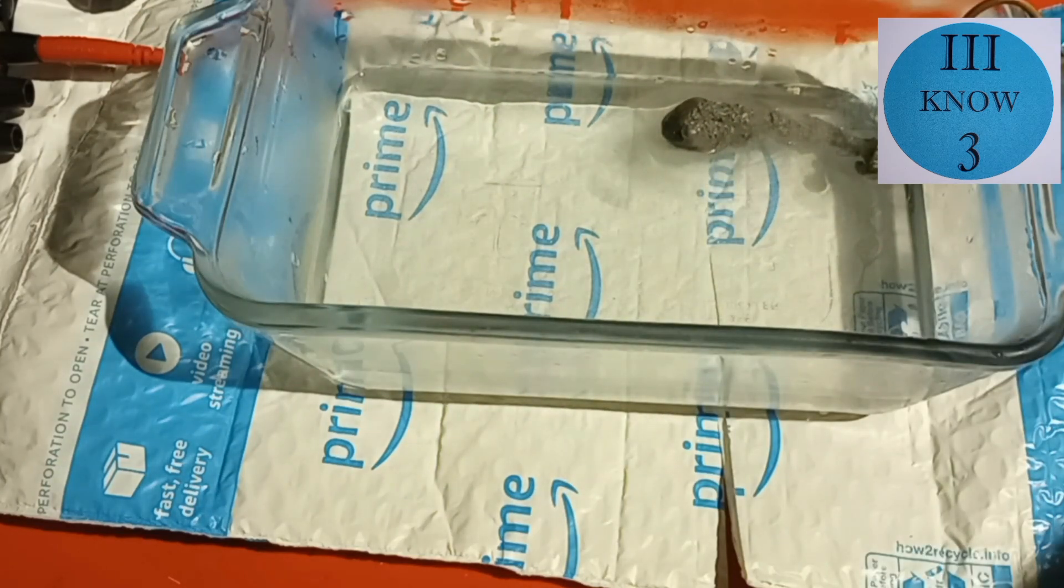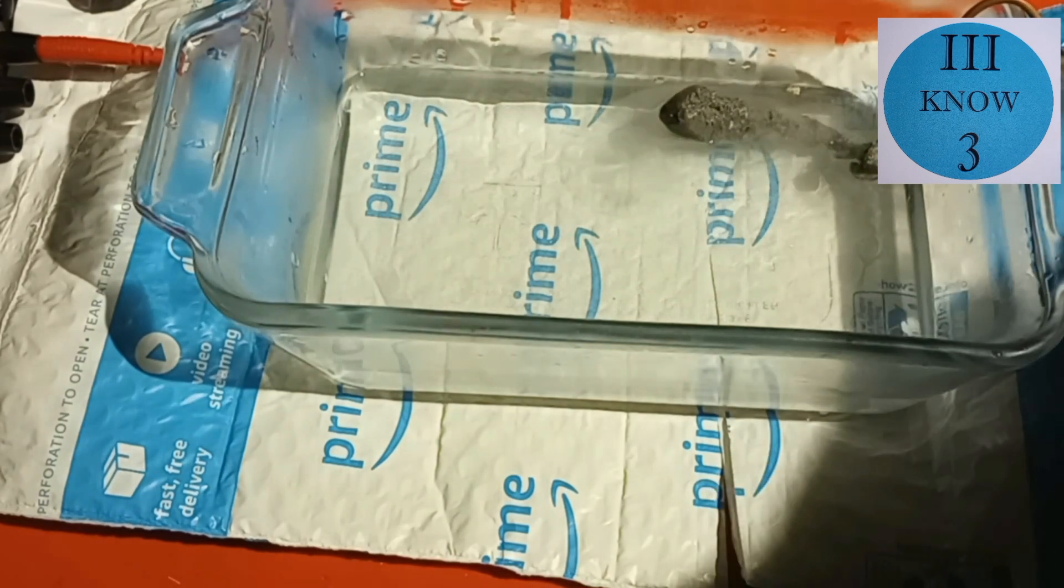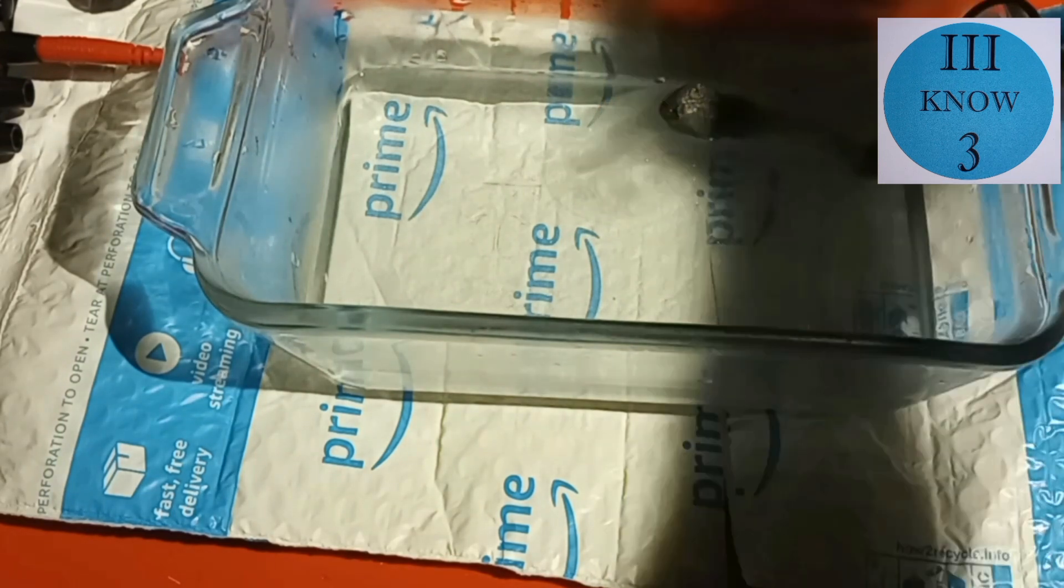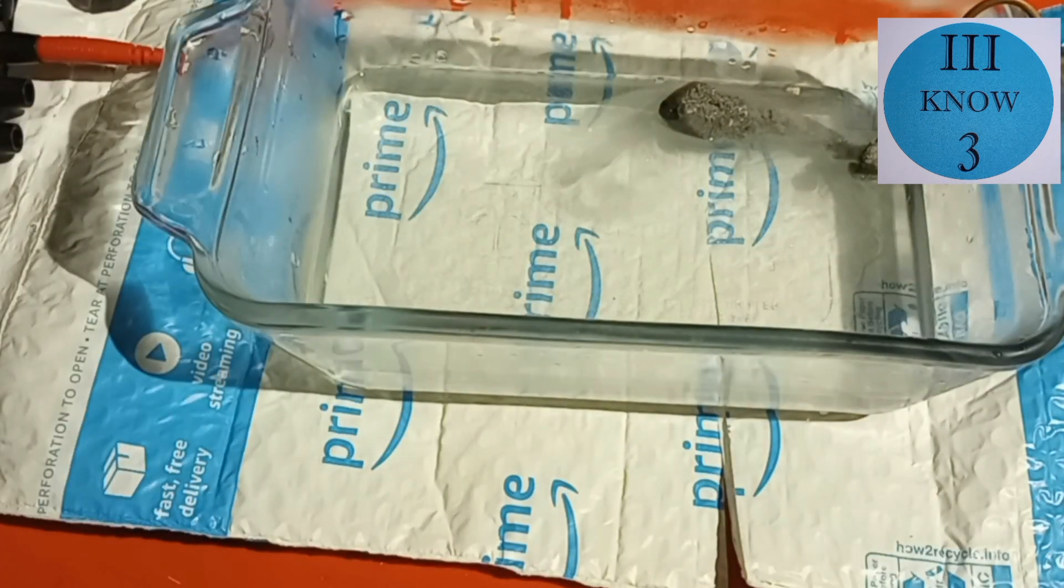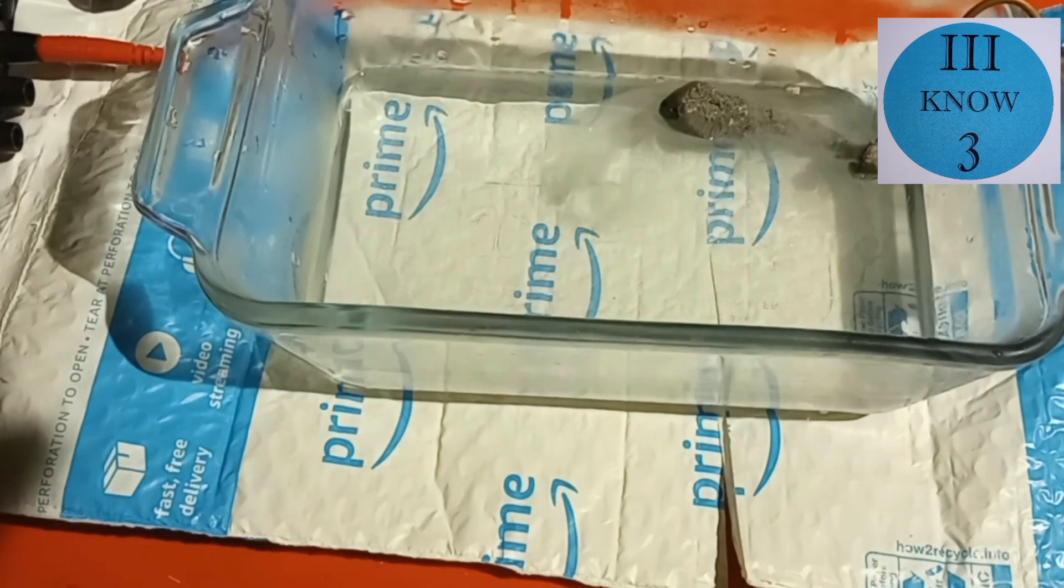we're going to use one of the cathodes that I left the spongy mossy tin substance on. I actually compressed that down as it was going so it would be more tightly packed and stick to the copper wire better.